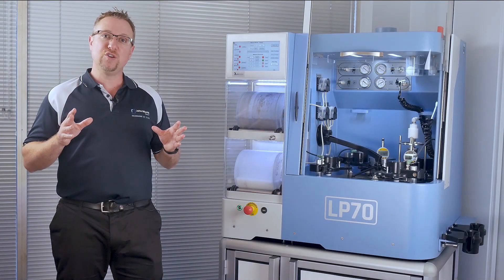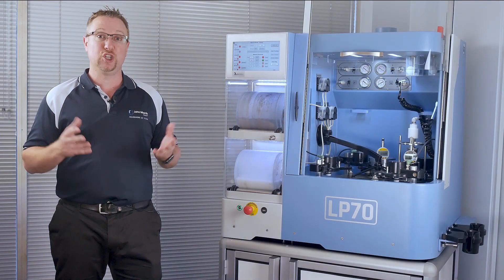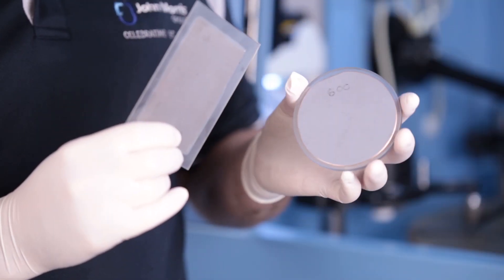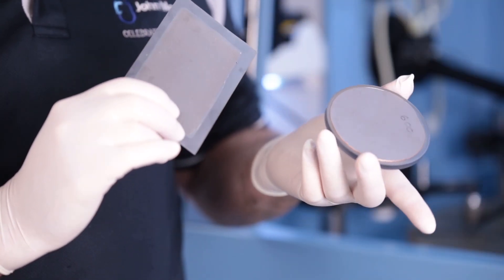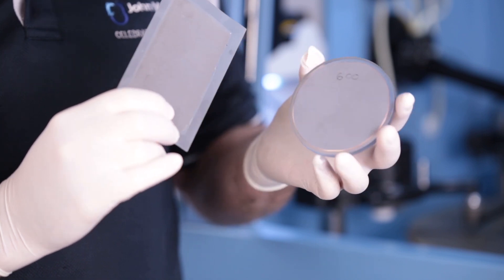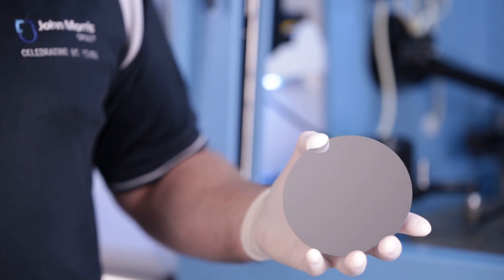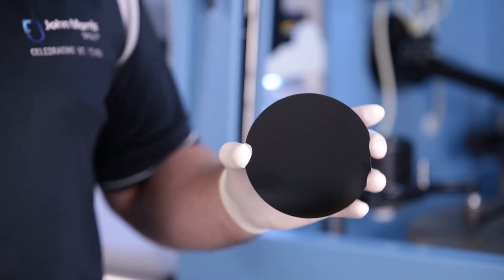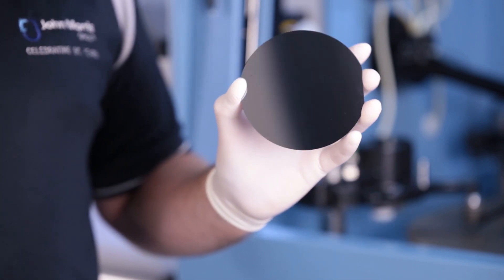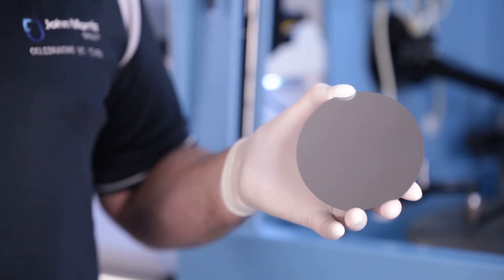Typical thickness variation values of less than 1 micron per inch and surface roughness levels of typically less than 5 nanometers, as well as flatness of less than 2 micron can be achieved on these instruments. The Logitech LP70 can provide for lapping and polishing for semiconductor wafers such as silicon, indium phosphide and gallium arsenide, as well as a wide range of other materials.